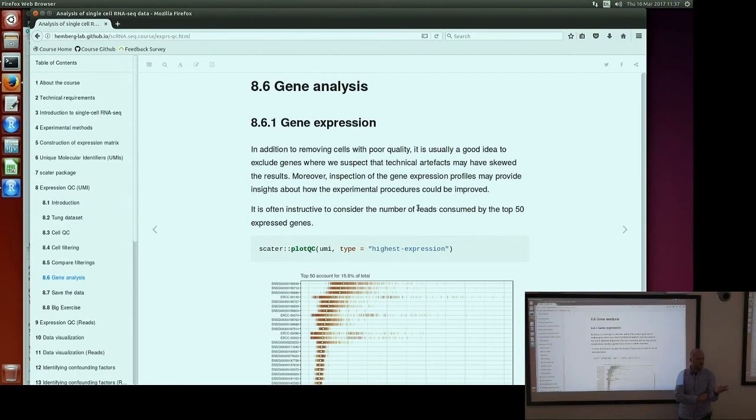It can be 0, 1s, right? If you want to add a column to the phenodata as used, then that needs to be either true, false, or 0, 1. It needs to be a logical vector of the same length as the number of cells, or else that attempt to assign will fail because it's not the correct size. For us it's why we use the logical, because when we merge all the filters together, you just say and, and you don't need to do any more operations other than that. So that's kind of easier. Of course, in such a command, you could use or statements or any combination.